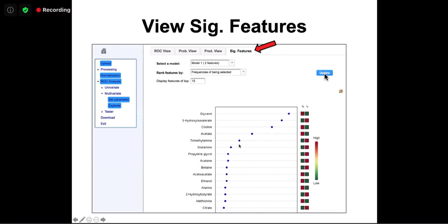So here it's exactly addressing the questions that you mentioned about feature selection. First, we do the feature selection only within each fold. We use 2/3 of the subsample to select features, then predict another fold that is not used for feature selection. Then we do another 2/3 to do the feature selection and predict another one not used for feature selection. So this whole thing is subsampling and prediction, and it's repeated as many times as possible because we are doing Monte Carlo.